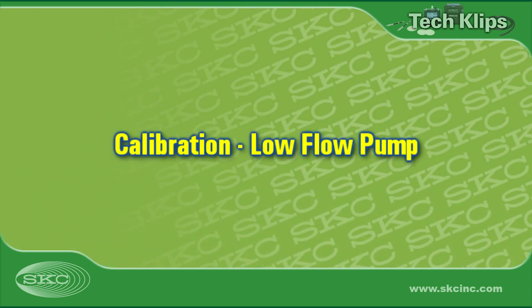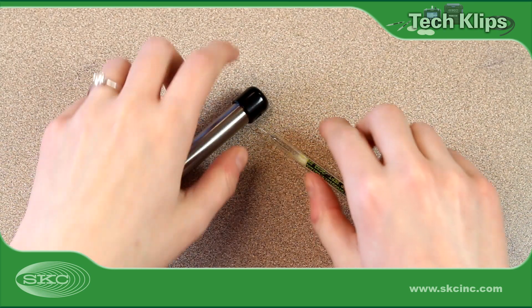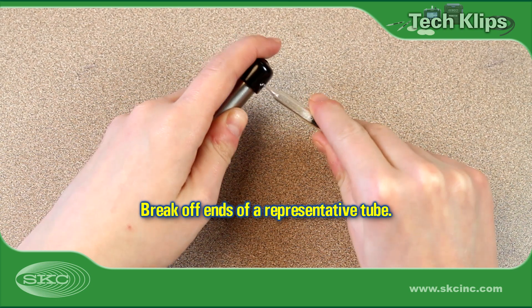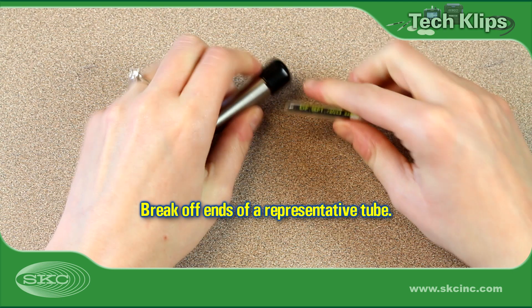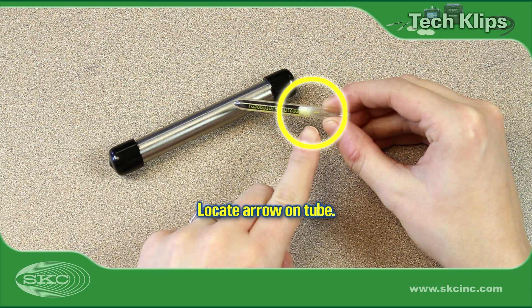Let's start with how to calibrate a low-flow pump that does not require the use of a low-flow adapter kit. As with all air sampling, it is best practice to calibrate pump flow rate before sampling and to verify flow rate after each sample. Use a tube breaker to break off and retain the ends from a sorbent tube representative of the tube to be used in the field. Locate the arrow printed on the sorbent tube and ensure that it points to the pump — the direction of airflow — before inserting it into the tube holder.